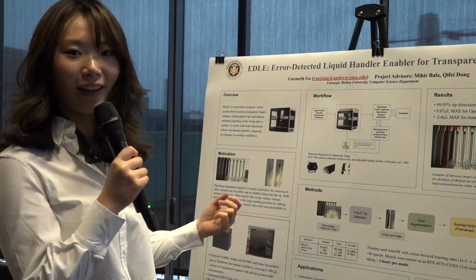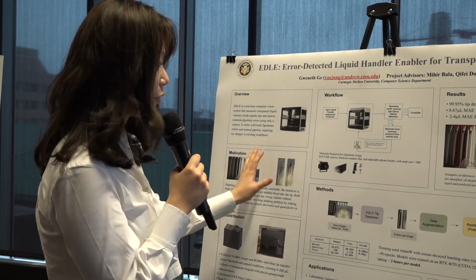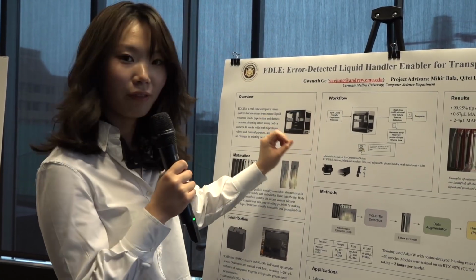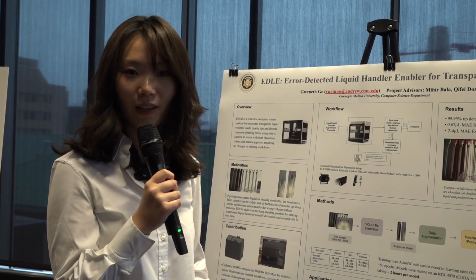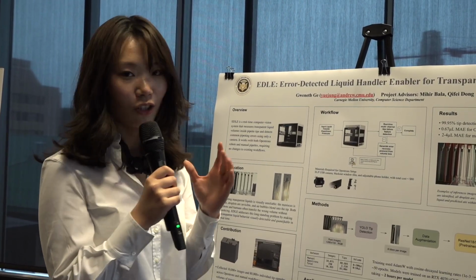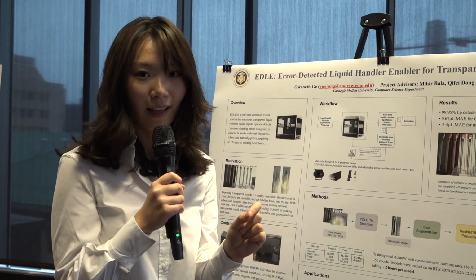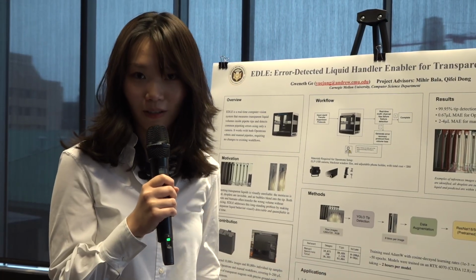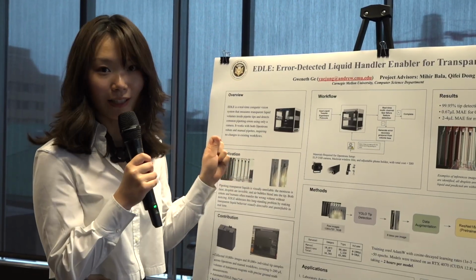Okay, so why did I develop EDLE? First of all, almost no liquid handlers on the market or in the lab have a monitoring system that can tell you what exactly happened when it's running. So if you are away from the lab, it is really hard to know what happened. If something goes wrong in the middle, you wouldn't know, and your samples, which you may have been working on for months or years, may be discarded just because of this. So we really need a monitoring system.